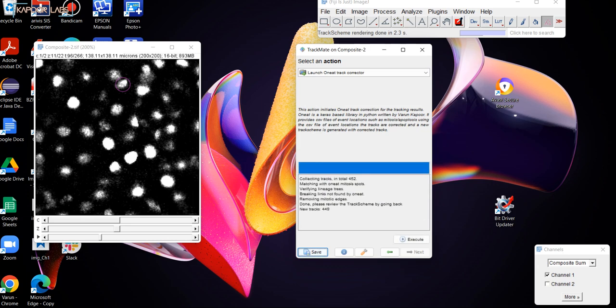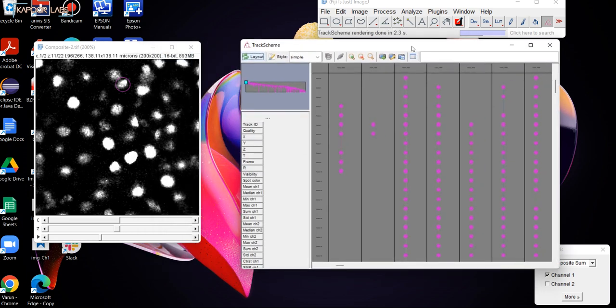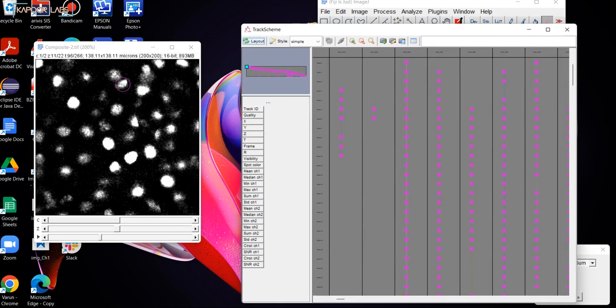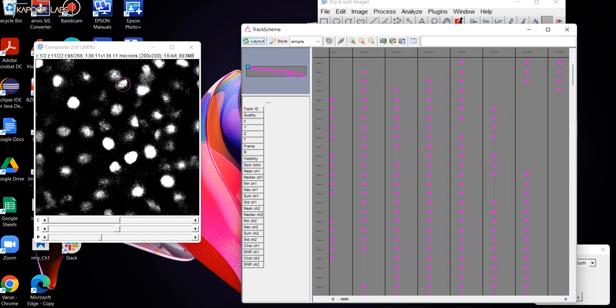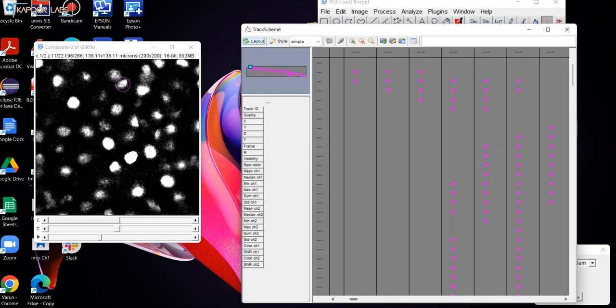It started with 452 tracks and ends with 449 tracks. Now let's go and see in the lineage tree the tracks that it actually found and how they compare with the LAP tracking that we did before. Again, I'm searching for dividing tracks and seeing the result of using this algorithm.